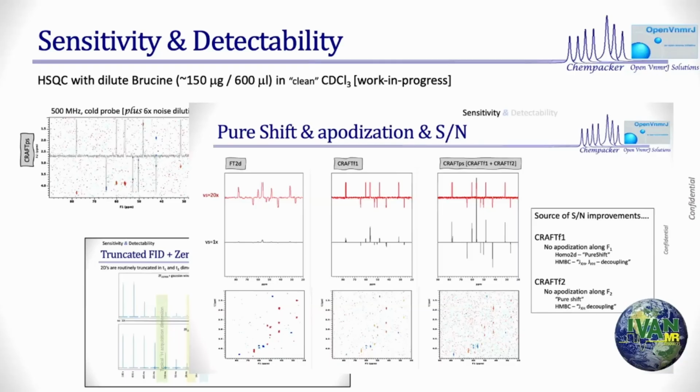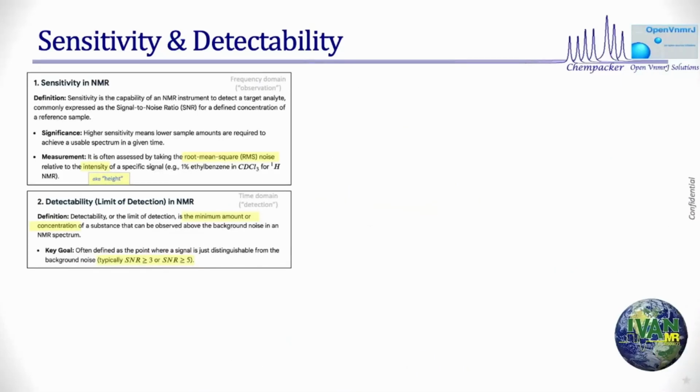Go do an HMBC decoupled experiment. I challenge you. I have done 10 years, 15 years with Gary Martin on this. It's not that simple. It's not that simple. So those are the benefits that you have by just getting into the tabular domain.